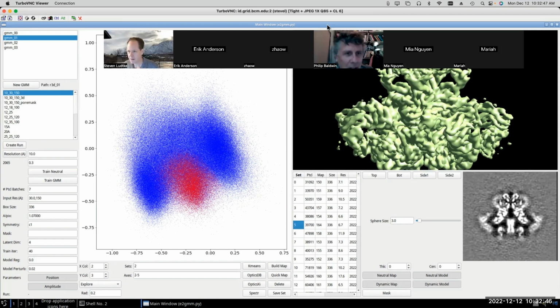Okay. All right. Any other questions? Then how do you create a movie to visualize the motions?